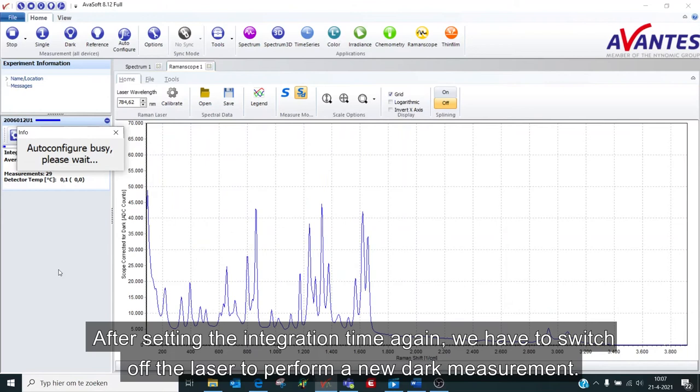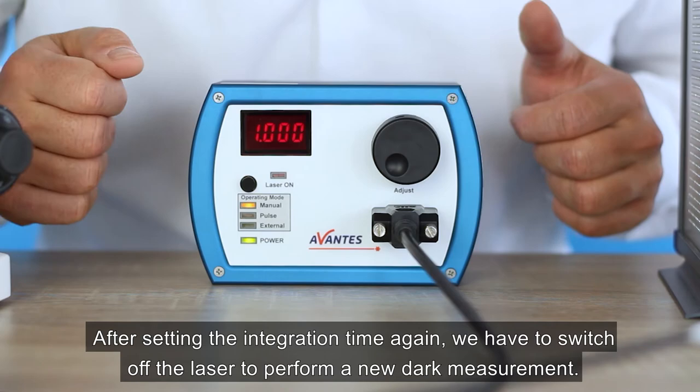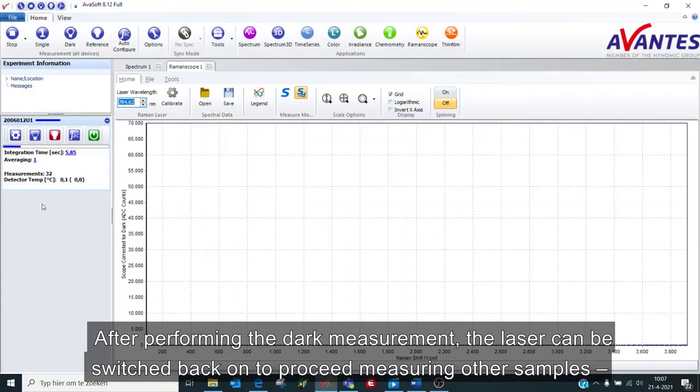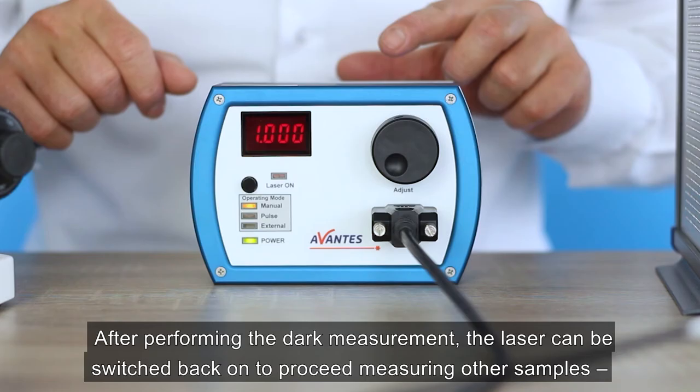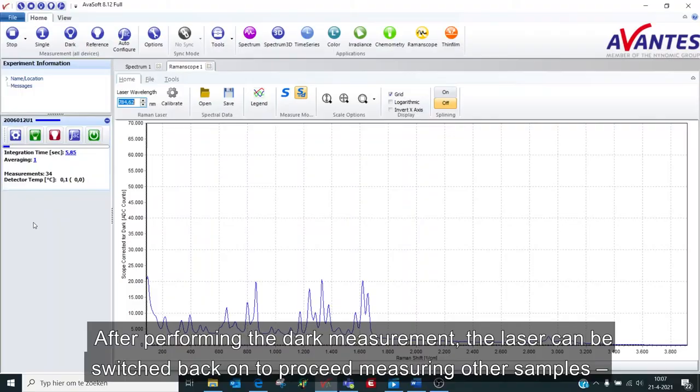After setting the integration time again, we have to switch off the laser to perform a new dark measurement. After performing the dark measurement, the laser can be switched back on to proceed measuring all the samples. In this case, the medicine aspirin.